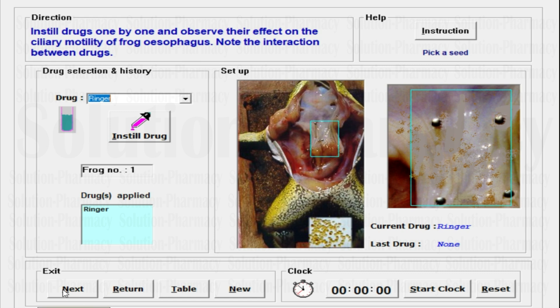Next to this, we have a button called the Exit button. Under this exit tab, you will find Next — meaning the question-answer section will begin. Then there is Return — if you want to go back, you will return to the menu page. Then the next one is Table. If you click Table, you will see the observation window showing the effect of that particular drug. Next one is New — if you want to create a new experimental animal or select a new frog, you have to click the New button.